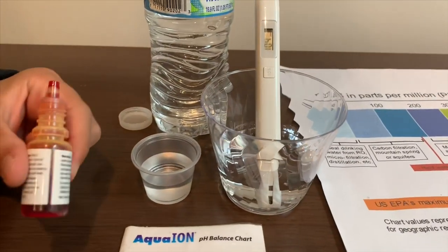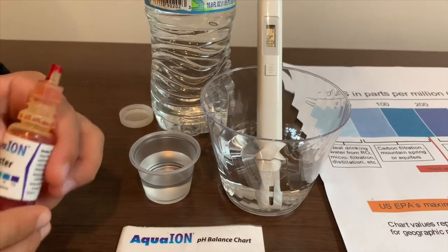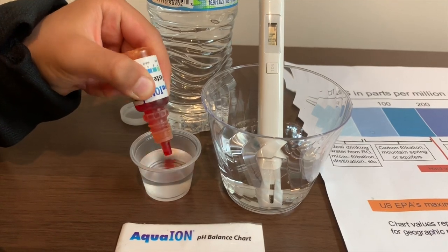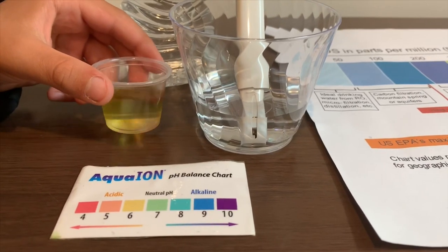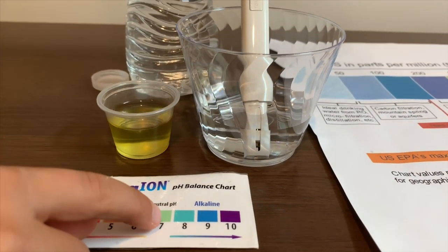Now let's test the pH level. If you want to buy this pH tester, check the link down below. Only do two drops. Let's stir it a little for a better result. I'm getting a 7 — this is a neutral pH.